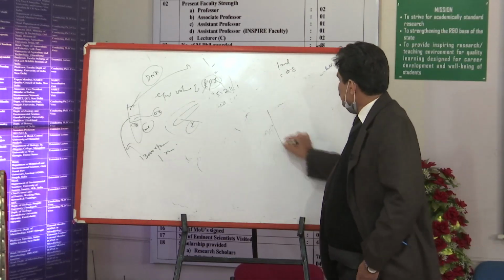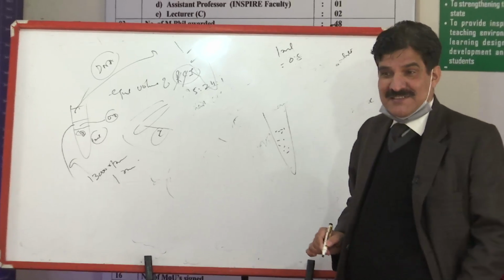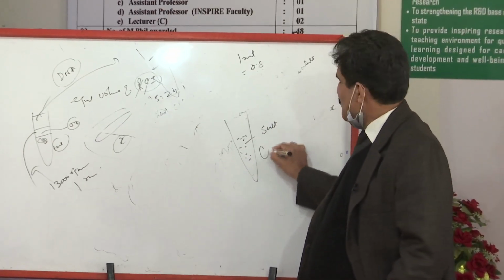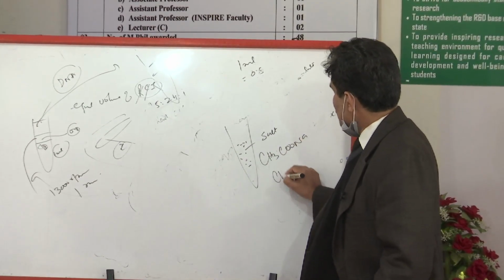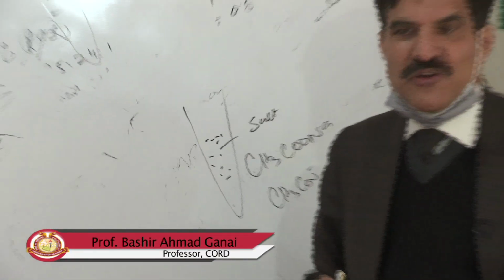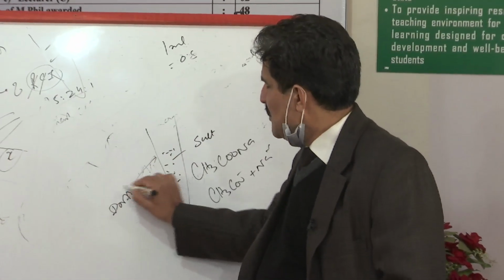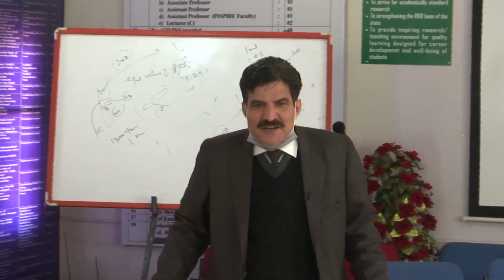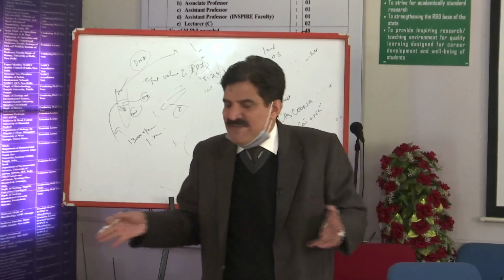In the aqueous solution, you are adding DNA and a lot of other things. When you add the salt, sodium acetate, CH3COONa, in aqueous form it will be dissociated. You must know DNA itself has a negative charge. Negatively charged molecules repel each other, and when you try to achieve precipitation, they will move apart.